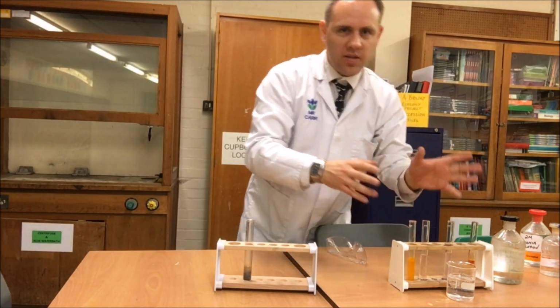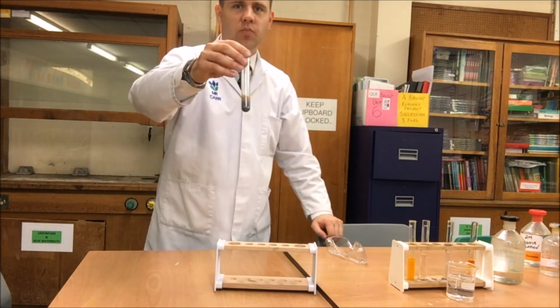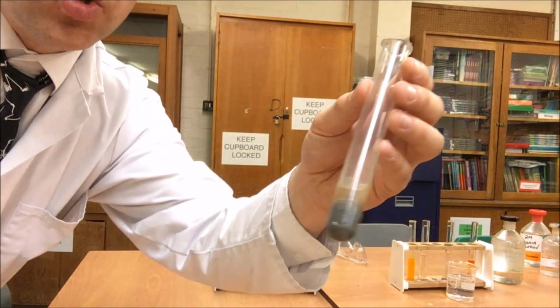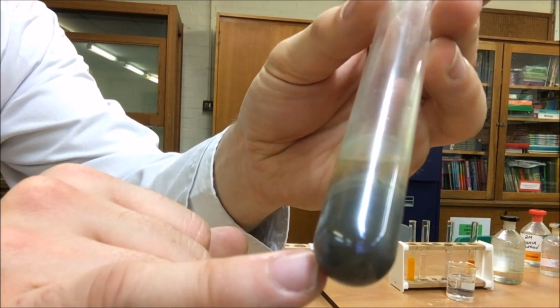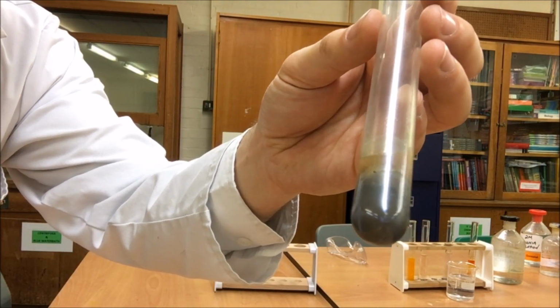Now then, prior to doing this, I actually did one as a practice shot, and this is the practice one for the Tollen's reagent. We used a slightly different ammonia solution to be able to make it, but you can just about see here a little bit of a shiny mirror. It's not as effective as I would like, but we shall get on that for our next lesson in our PAG when we do this.